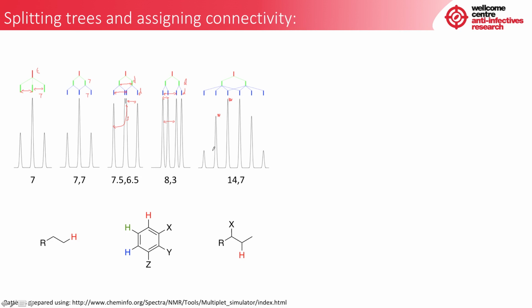So there is our quartet J value. We can distinguish that this is the quartet from the intensity pattern. And then to identify the second quartet, we can see that here we have the first 2 lines of a quartet. We would expect another 3 here. However, what we have is 4, and this is because the first line of the second quartet is being added on top, and so here is our J value, which is the equivalent of this space. You don't have to use the edges, so you could equally use that.